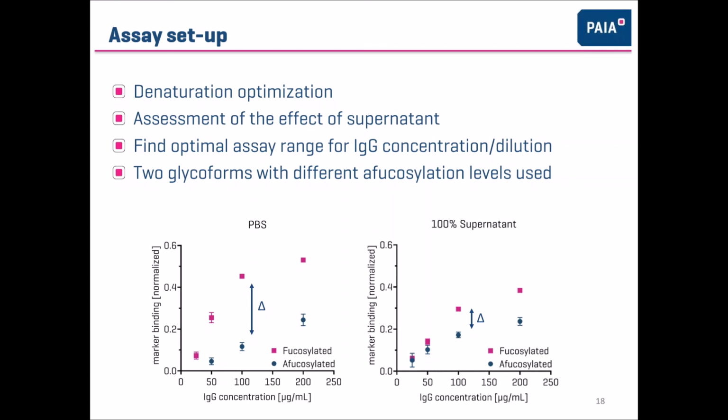I wouldn't be sure that glycan screening makes a lot of sense in static cultures, but I may be wrong. Yeah, the scale up happens predictably. The protein concentration is surely low. What I'm trying to get at is how early can the PAIA kit be put in place?